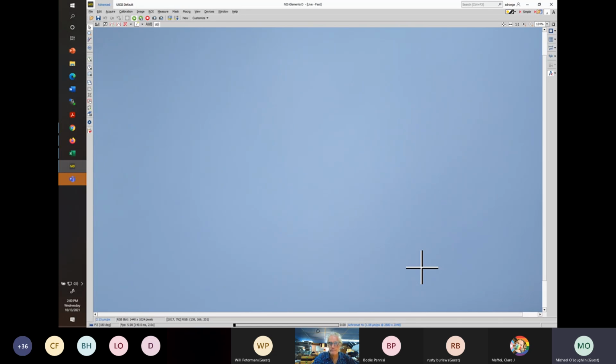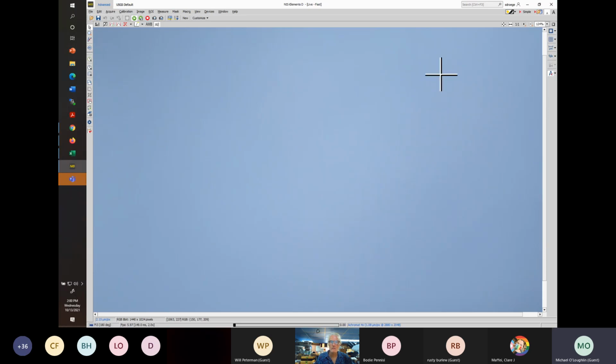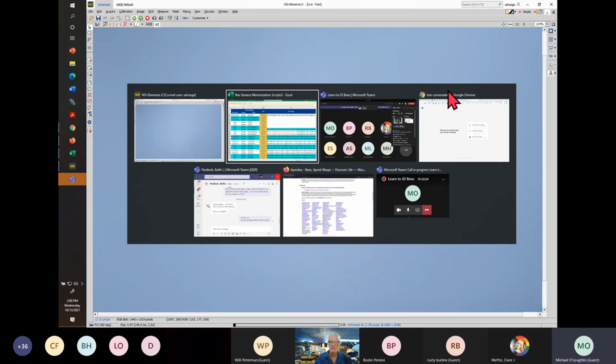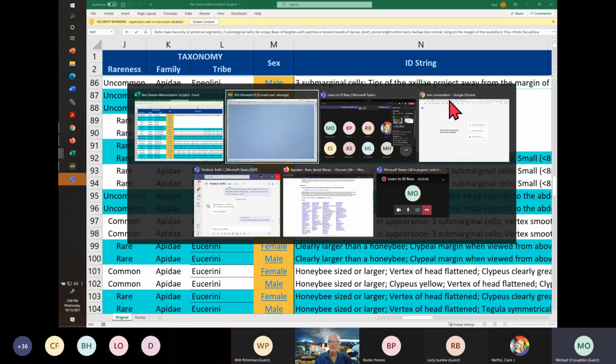Okay. Michael says the Oregon Bee Atlas has found Neolarra in 2 locations in Oregon. So yay! Excellent. And Will asks, how do you get something so small to pull so nicely for going on a point? That's my nightmare. Are there any tricks to pass on, or was the first one just a lucky pose? So probably it was a lucky pose.